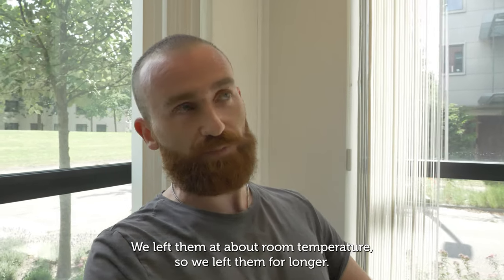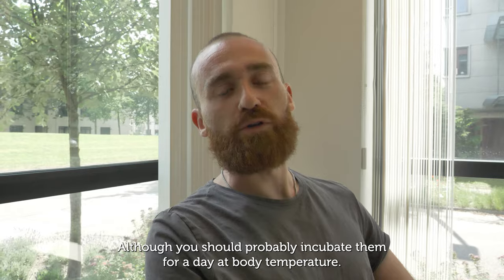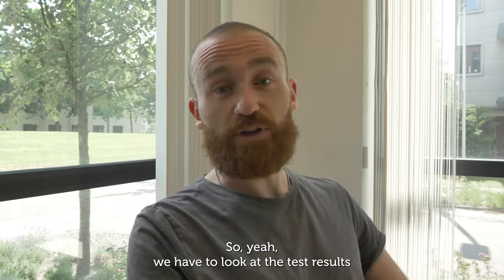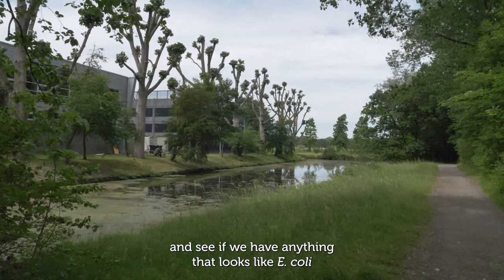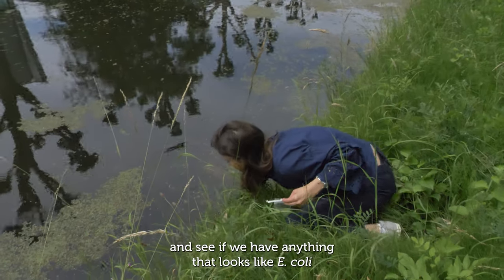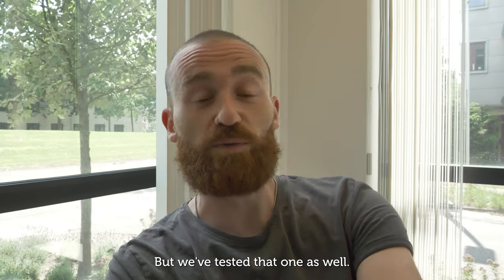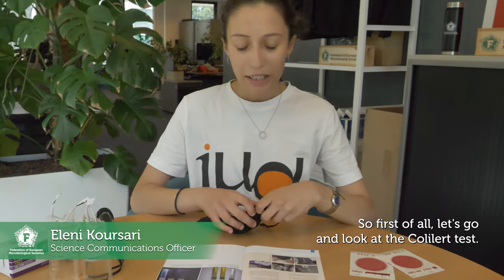We're back at the FEMS office — our tests have been incubating for about two days at room temperature. We left them longer than ideal; normally you should incubate them for a day at body temperature, but we don't have an incubator here. We're looking at the results to see if we have anything that looks like E. coli in our Delft Canal water, and hopefully not in our tap water. First, let's look at the Colilert test.